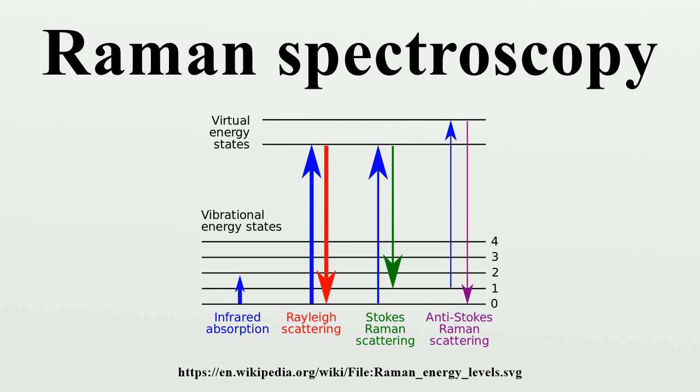Raman gas analyzers have many practical applications. For instance, they are used in medicine for real-time monitoring of anesthetic and respiratory gas mixtures during surgery, in solid-state chemistry and the biopharmaceutical industry. Raman spectroscopy can be used to not only identify active pharmaceutical ingredients, but in the case of multiple polymorphic forms, it can also be used to identify the polymorphic form of the API.